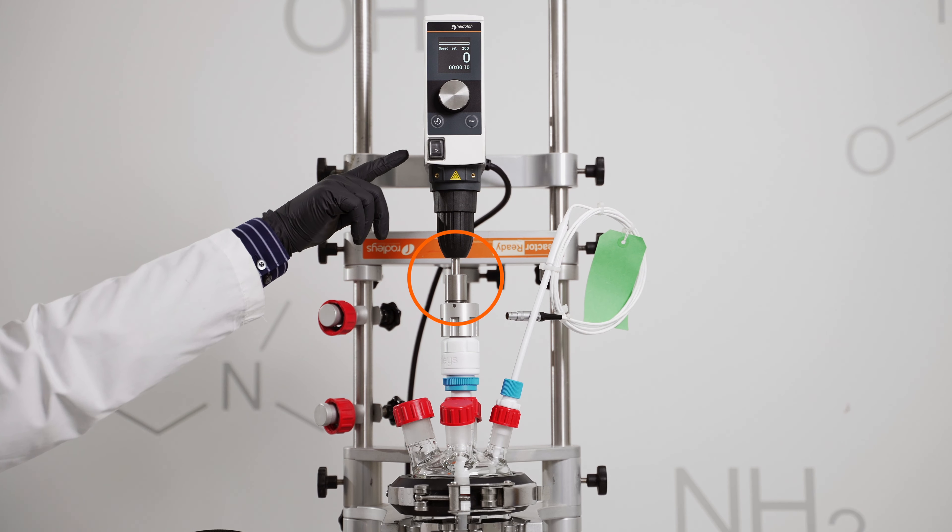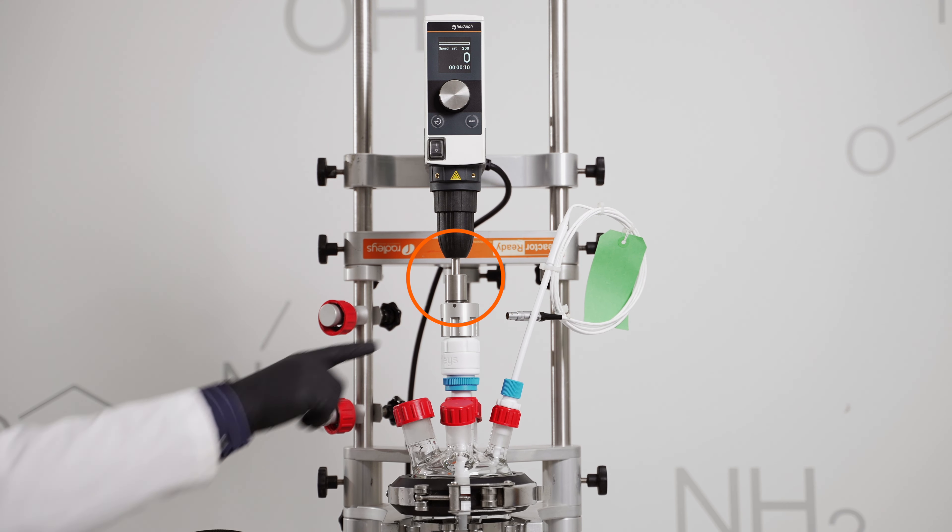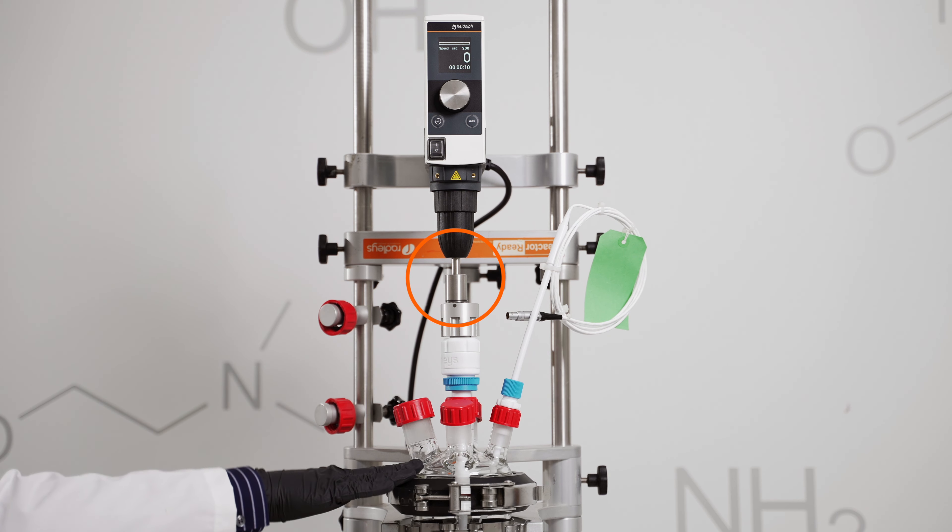The drop-in coupling inserts into your overhead stirrer, similar to how our impeller would, and engages with the stirrer guide on your reactor vessel.